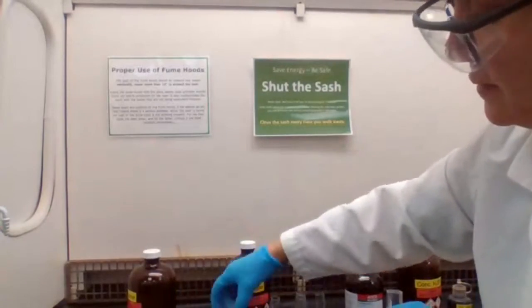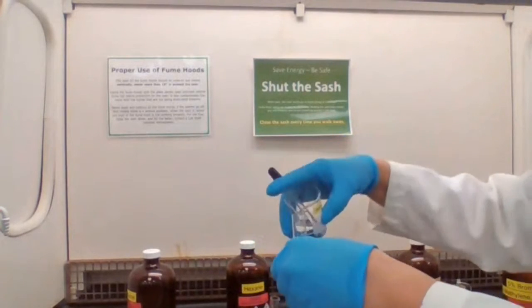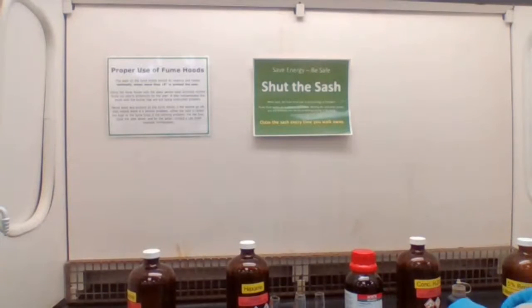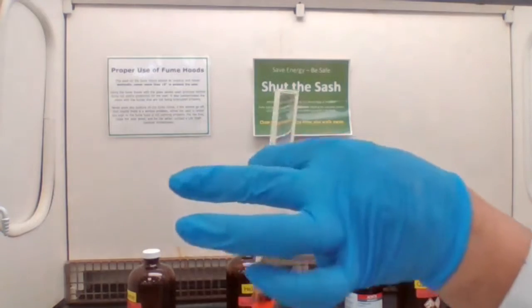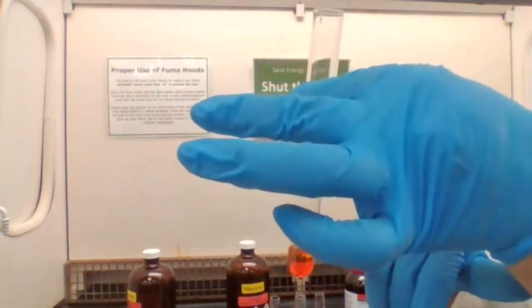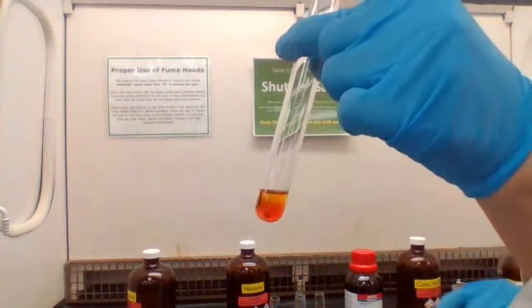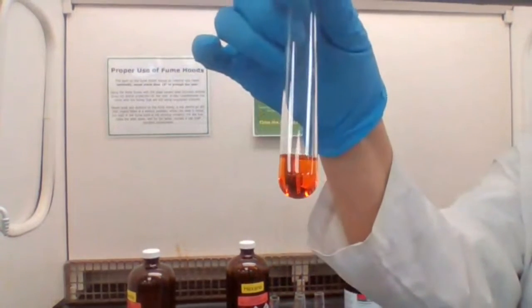Going to test hexane now with bromine. So reaction of hexane plus bromine. Hexane plus bromine. Record your observation.